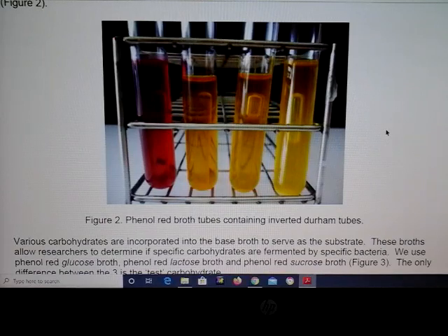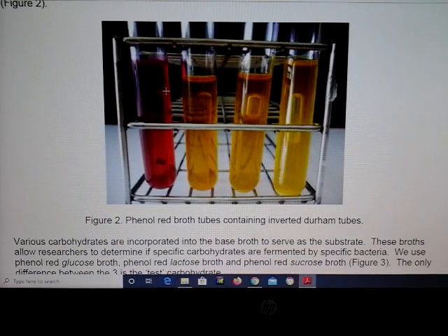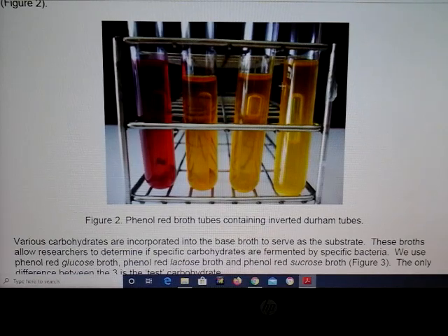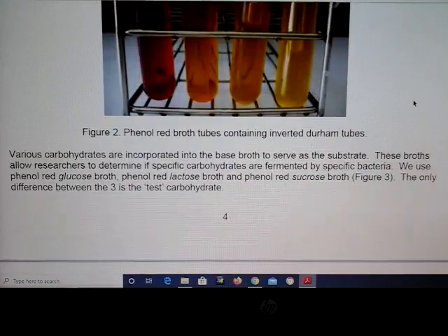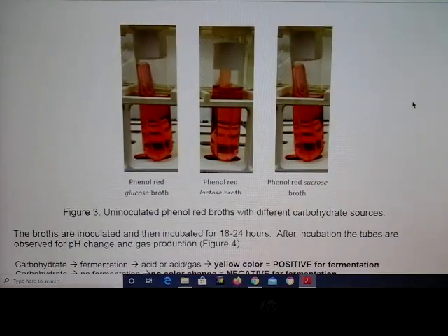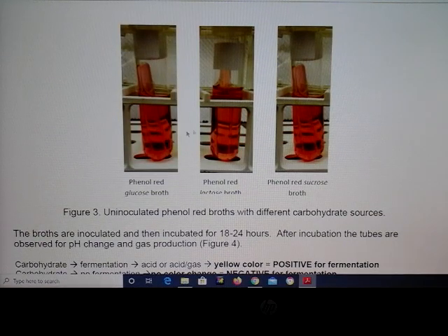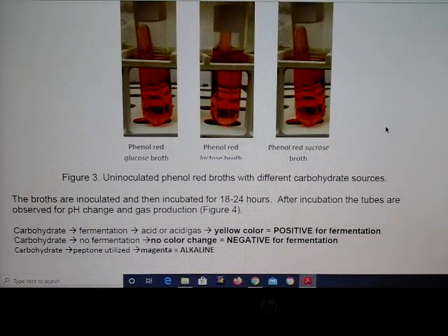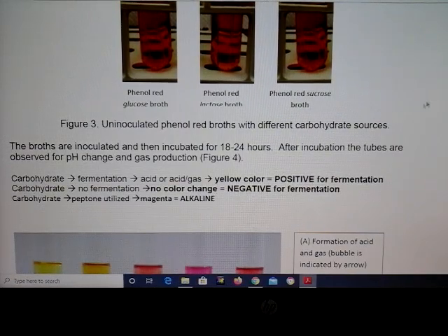In this illustration, the left tube is uninoculated. As you move across, you can see that the tubes turn yellow, and here is a nice example of a bubble showing gas production. This is an example of negative results — no fermentation took place, and these three tubes all stayed red. So yellow is positive, and no color change — remaining red — is negative.